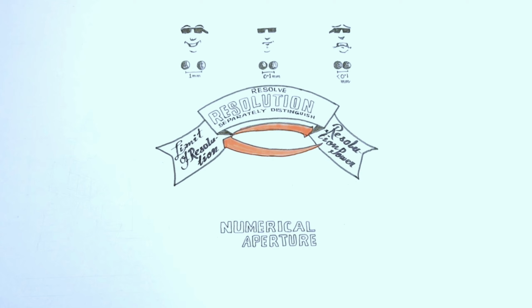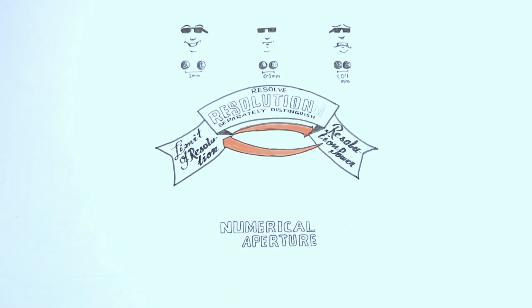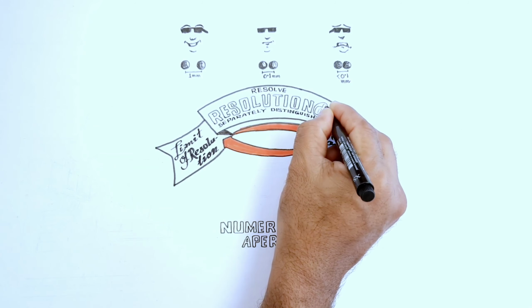So, from the above discussion, we can say that resolution is the term by which we simply refer to a certain distance, and it is measurable and is represented by d.